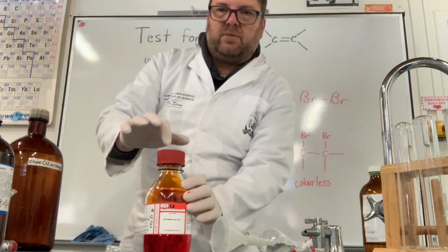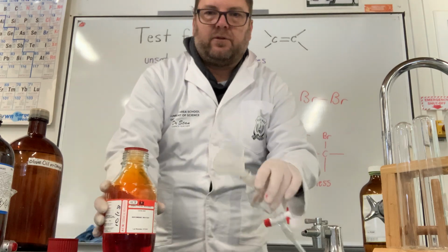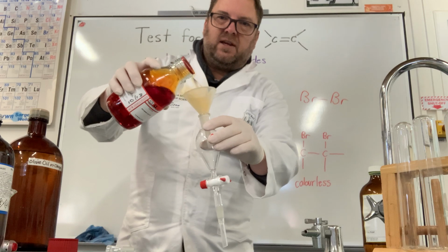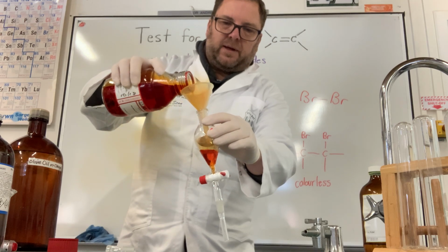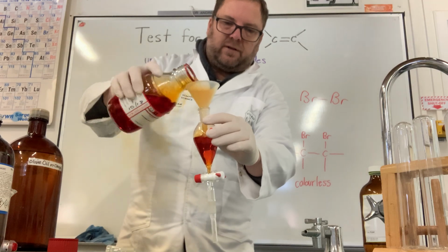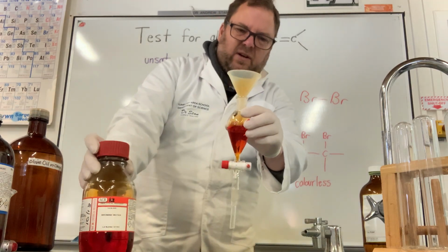The bromine attacks the plastics in the lid, which is why they perish quite quickly and become hard to undo. We add some bromine. You can see the gas of the bromine falling out there, and strictly speaking I should be doing this in the fume hood. The problem is that if I do it in the fume hood, it's harder to video, and if I have the fume hood turned on, you can't hear anything I'm saying.